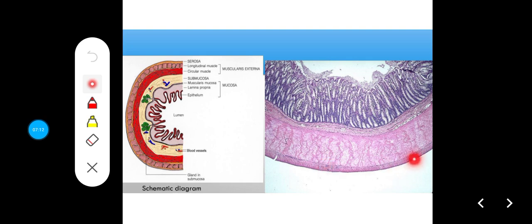So look at this as well. Look at the muscle layer here. You can't call this the colon because you can't really find the tenia. Now look at how smooth and continuous the muscle layer is. Now look at the mucosa. Simple columnar epithelium, though the rectal folds are not really prominent here, but this is not the colon because you can't find the tenia coli. So this is a classic slide of the rectum. And then you can also appreciate the intestinal glands and the simple columnar epithelium here.